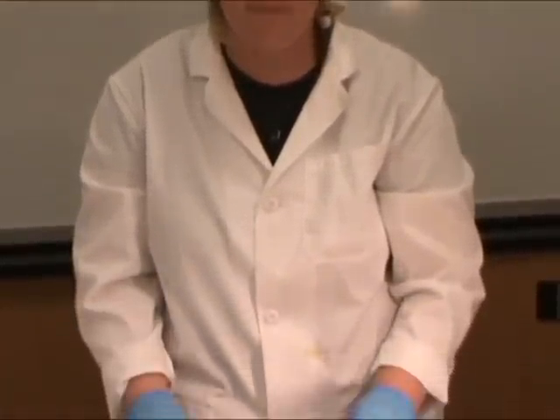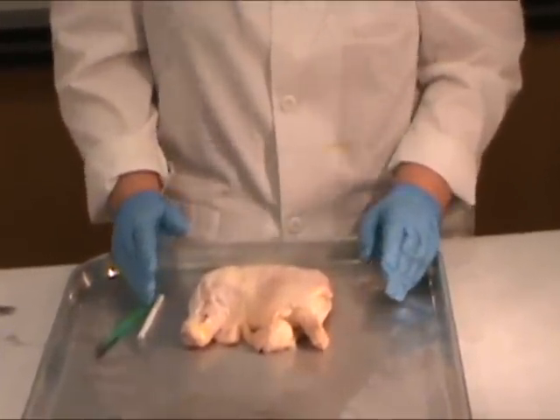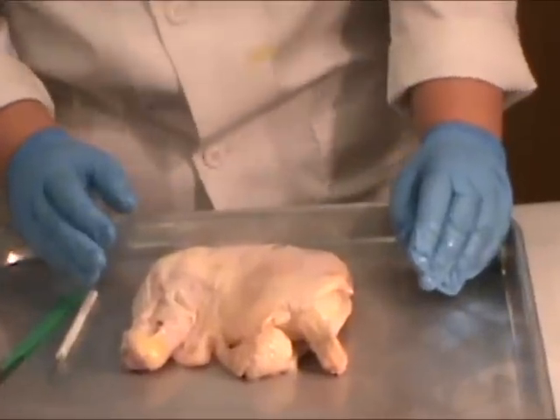Hi, this is Dr. Hayes at North Seattle Community College, and today we're going to be doing a chicken leg dissection. This is a typical chicken leg that you would find at the grocery store.